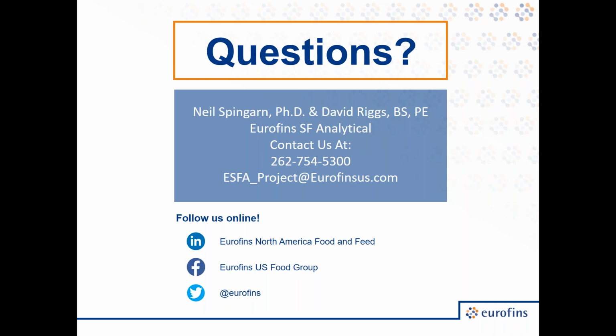We get a lot of work from beverage manufacturers with foreign materials floating around in the beverage. And a very high percentage of them, as Val mentioned earlier, are actually backwash. Somebody takes a medicine, chugs some water, puts the bottle down on the counter, comes back an hour later, looks at the bottle, and they see something floating around in the bottle, and they panic.